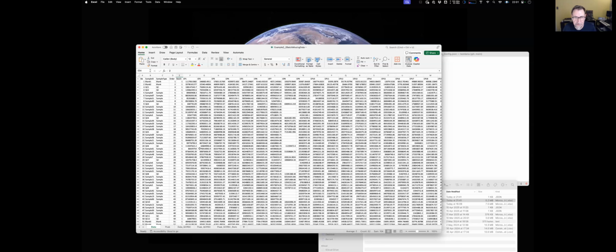That's why I was so lucky to work with Rick Dunn in Manchester when we first developed this, because I would just tell him how many QCs I wanted, and he went away and did that. And that's where we hit on every 5th sample, which is a lot of QC and a lot of extra injections, but you end up with a really good data set.